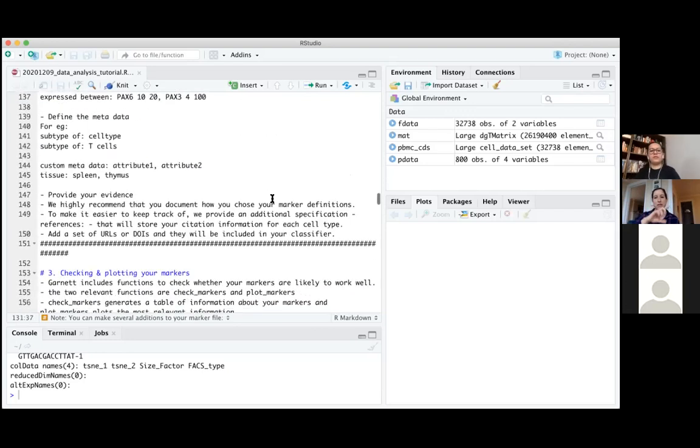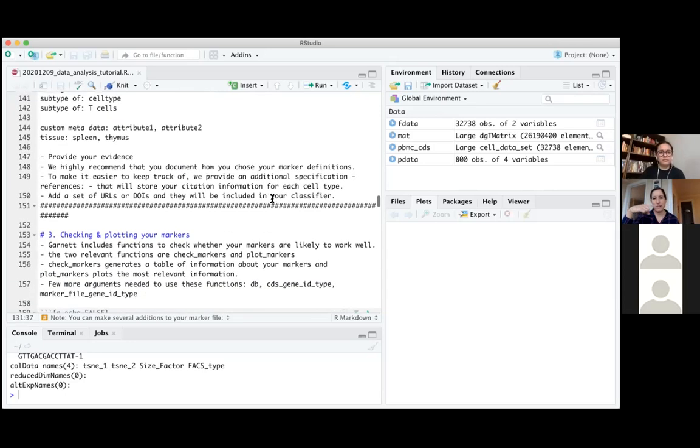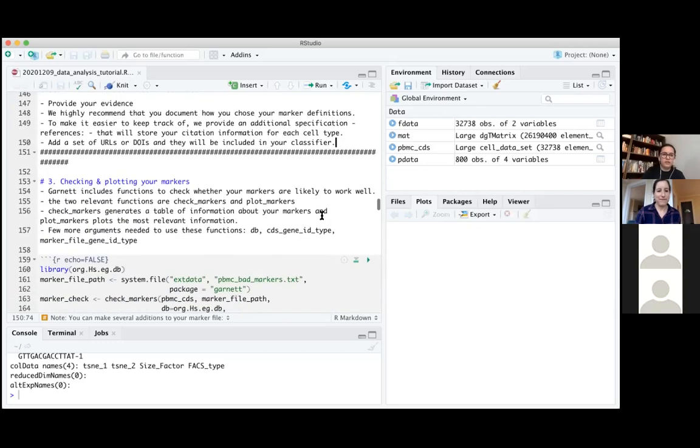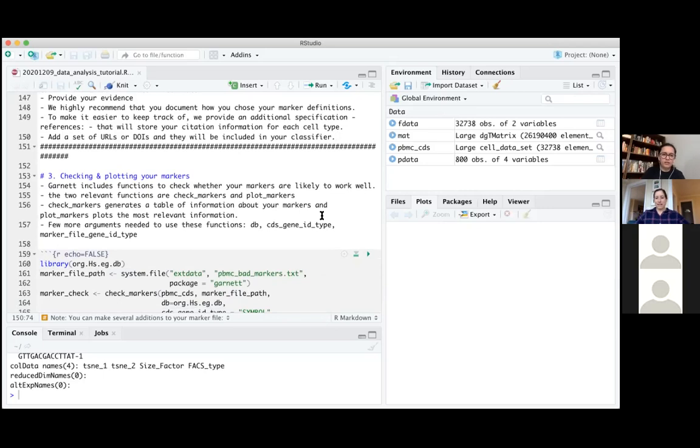And I would say generally when you're making these marker gene files, this is the place where you run it iteratively and maybe make a couple versions of your marker files so that you could say, if I add 3 more genes for each marker, does it make it worse or better? And the more genes you add, if they're not specific, it's just going to worsen your results. So I would say add more genes prudently.